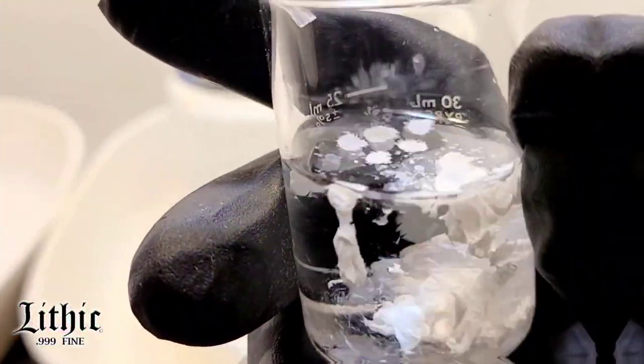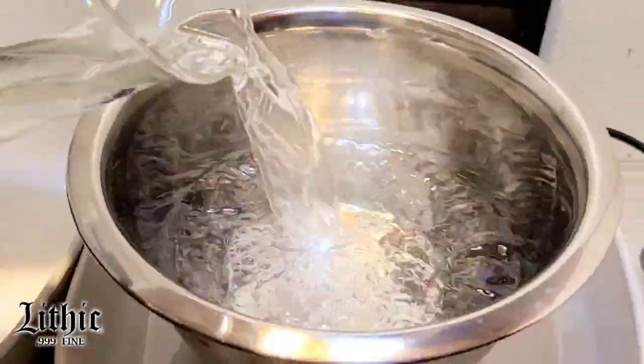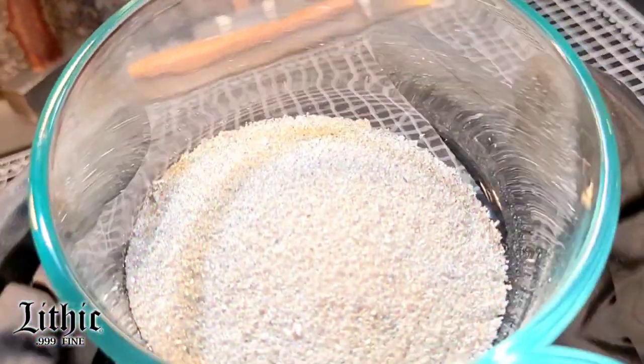Hi, I'm Jeff and this is Lithic Metals. Today I'm going to be making an electrolyte solution for my silver cell.